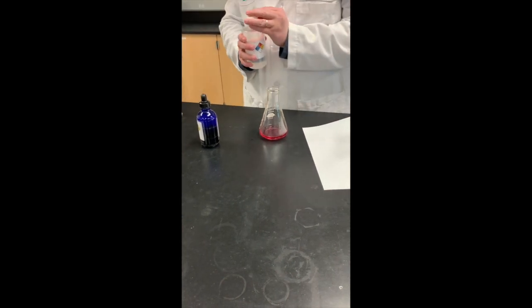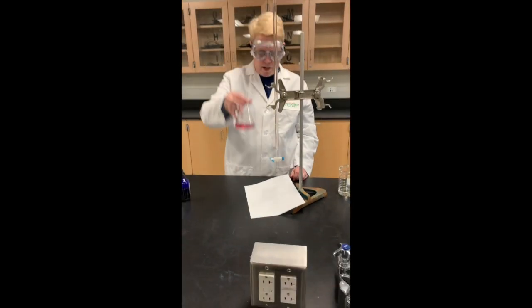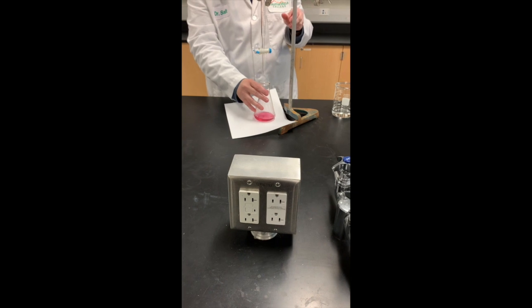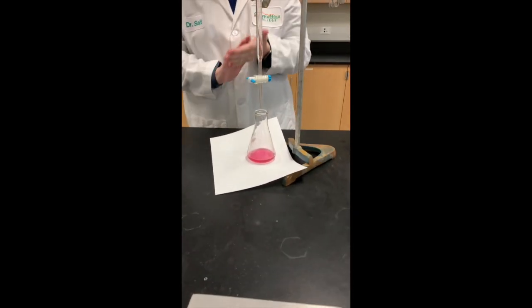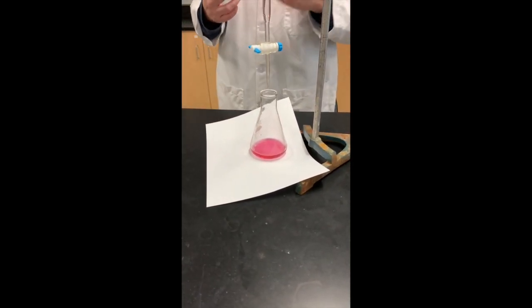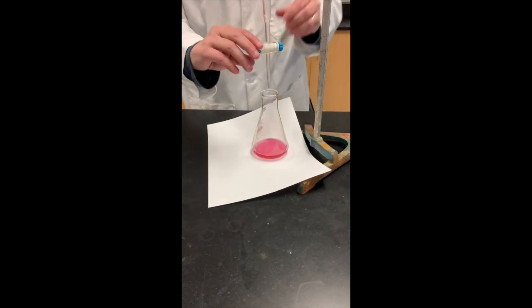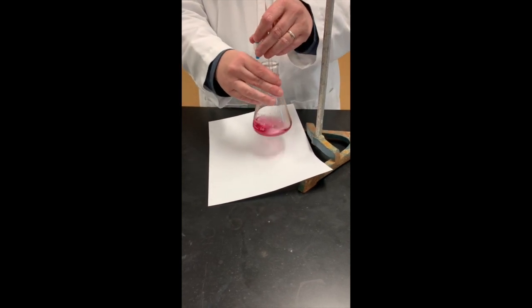Okay, so we've got that all set. Now we're going to titrate just like we did again. Notice it's that nice red color, and we're going to titrate until it goes to that blue. Okay. Now this should take more than it did for the blank. Typical titrations take between 35 to 45 milliliters. We're going to add this, and I'm starting at 0.00 milliliters of my initial EDTA volume, and we want to add and swirl at the same time. So I'll go ahead and add and swirl.